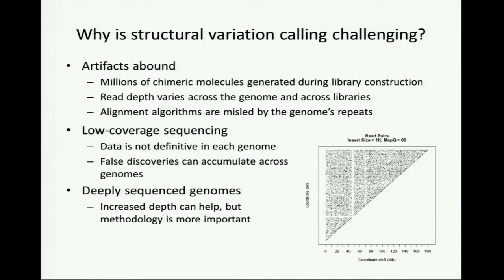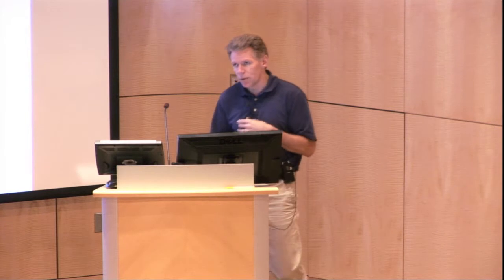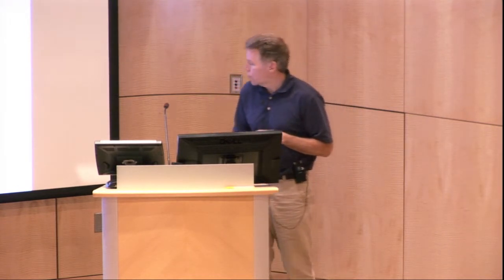Low coverage sequencing makes this problem even more difficult, although in our experience, while depth helps, methodology is actually more important. If your methodology isn't rock solid, when you add more depth, sometimes callers get more confident in their mistakes rather than getting better.